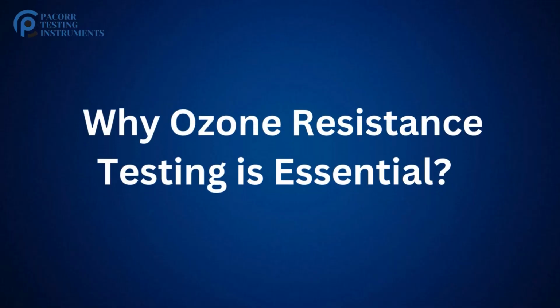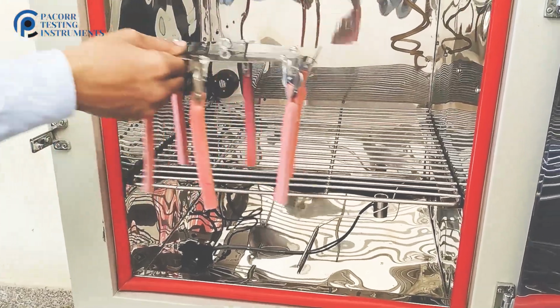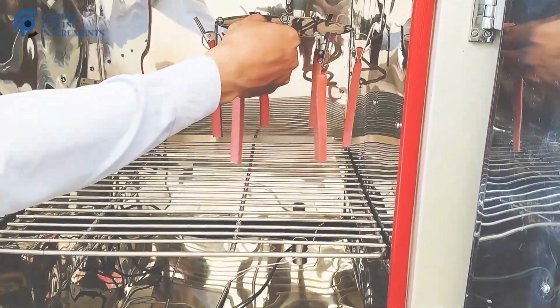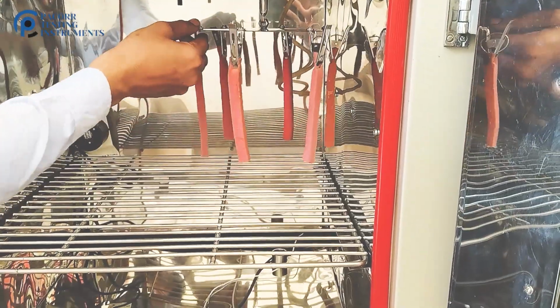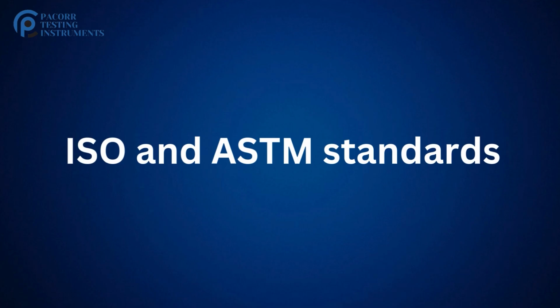Why is ozone resistance testing essential? Ozone in the atmosphere reacts with rubber, causing surface cracking, brittleness, and failure over time. To ensure long-lasting materials, industries follow internationally recognized ISO and ASTM standards.